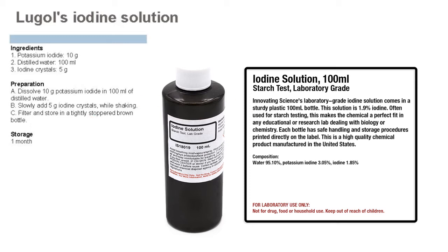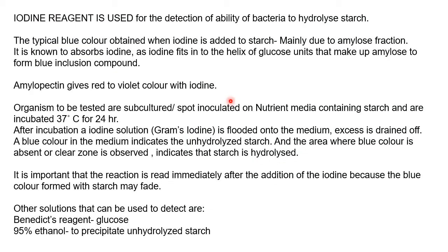Once incubation is done, aseptically add the Gram's iodine solution to your plate, let it react for one minute, then drain off the excessive iodine solution and wait for your results. That's how the test is done.